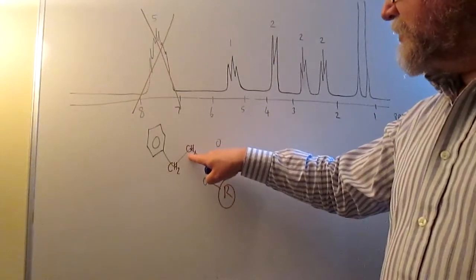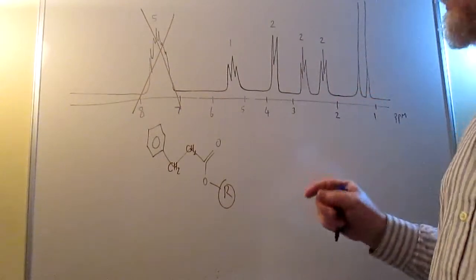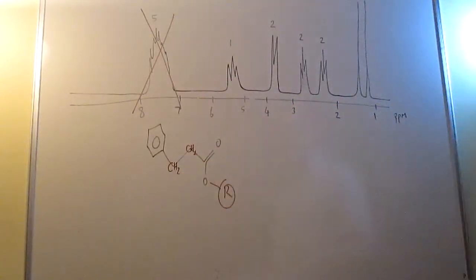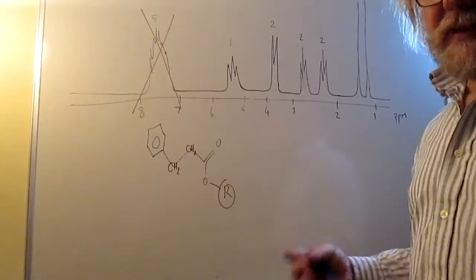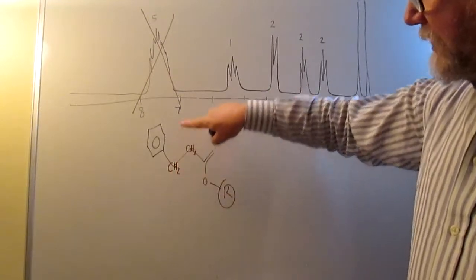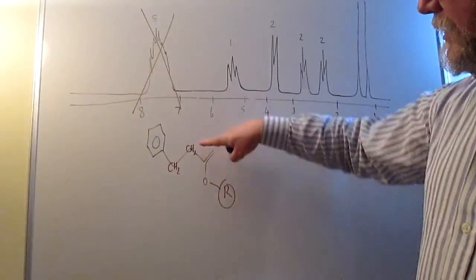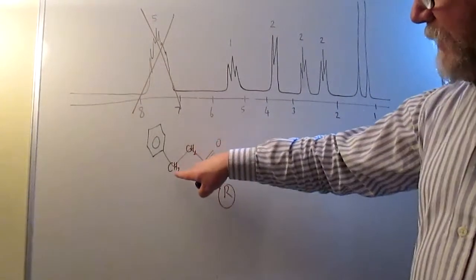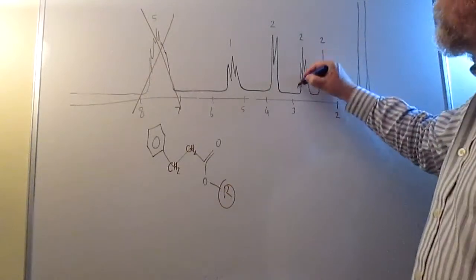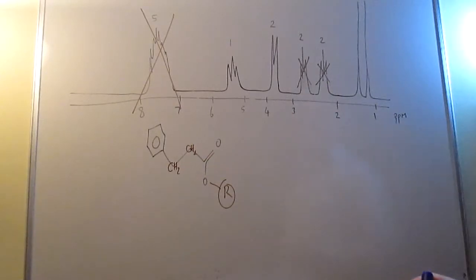And again, the CH2 here is next to a carbonyl, and again your data sheet says HC carbonyl is between 2 and 3, so that strongly points to those 2 peaks corresponding to those 2 CH2s. And you can see that also fits in with their splitting, because the peak that comes from these 2 is going to be split as a result of those 2. So 2 hydrogens on the next carbon means that will give rise to a triplet, and similarly here, this peak is split by those 2 on the next carbon, so that will also be a triplet. So the 2 triplets correspond to those 2 CH2s there. So we can eliminate those from our inquiries.